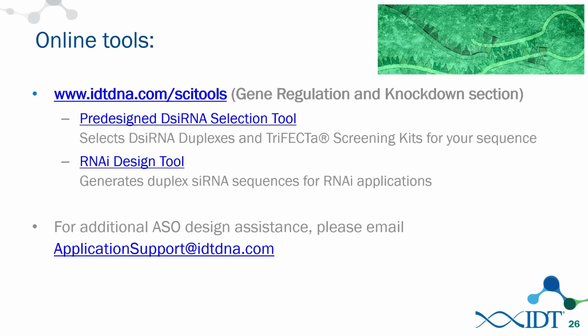And we do see it pretty consistent for a couple of days. I've not done studies which went out past 72 hours with the antisense oligos for long non-coding RNAs at this point, so that would be something you'd have to test. It also depends on how rapidly your cells divide, because they're eventually going to dilute out that antisense oligo too. So for rapidly dividing cells, the effect would not be as long as for non-dividing cells.